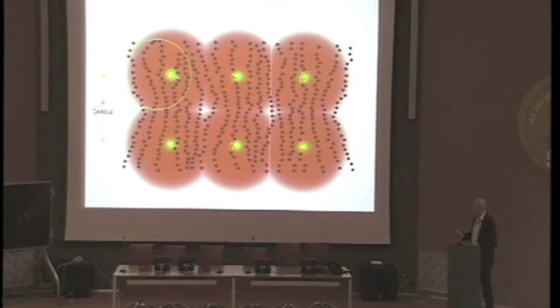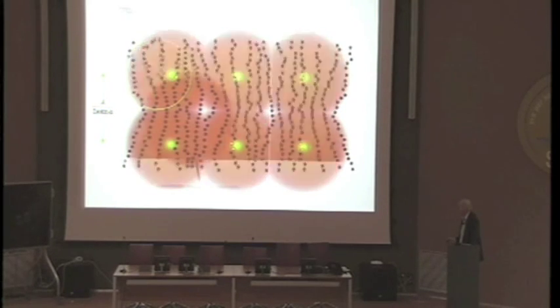Do we have to worry that this and this are there at the same time? No, because it's further away than Abbe's diffraction barrier. And if it's further away than Abbe's diffraction barrier, we can always separate. We can say it's sparse, and because it's sparse, there's no problem of separating it. So the problem exists only within this area. And once you have found a solution for this, you do it for the rest at the same time, and that's it.